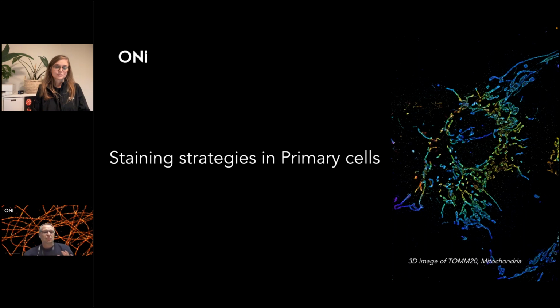What you do, you first optimize your staining with the cell line. You can take a Jurkat cell line, for example. If they don't express the protein you're looking for, you may express it in them. Because they're in suspension, you can use polylysine or collagen to make them adhere to the surface. Then you fix them after a certain time.